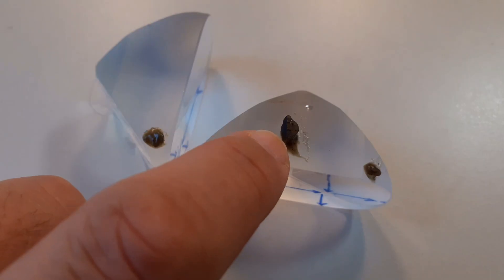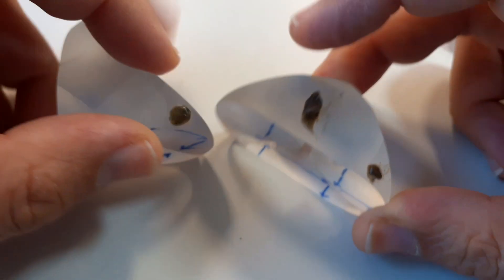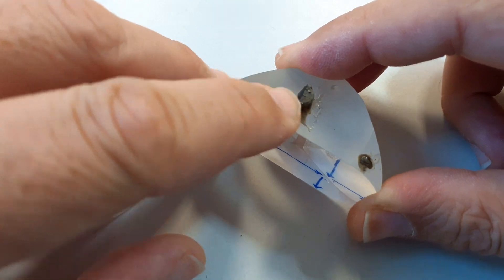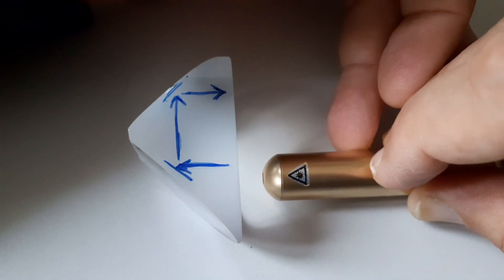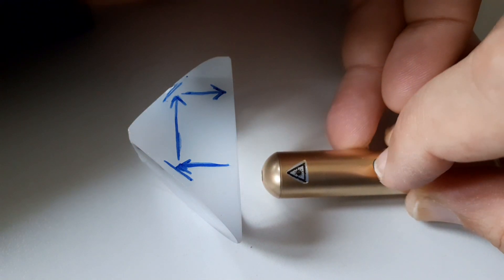So the surface of the prism does not contain any aluminum. And this gray-green stuff, that is the glue that holds the prism in place. It's important that the prism does not slip. Now I'm using a laser pointer to simply illustrate this. And you can see that the laser light enters on one side and then is reflected back on my finger on the other side.